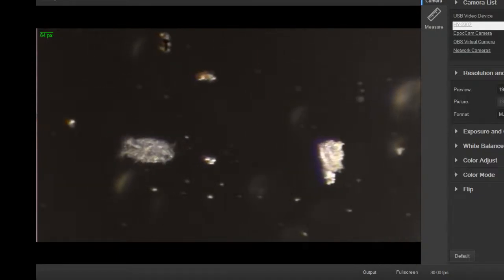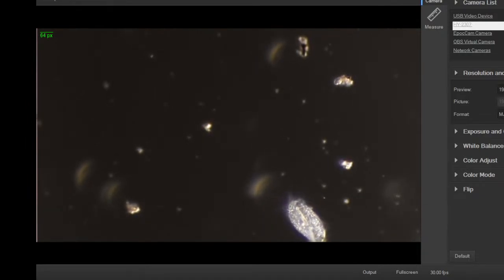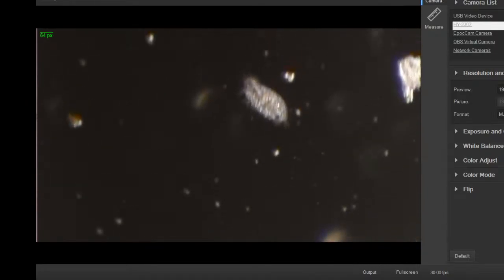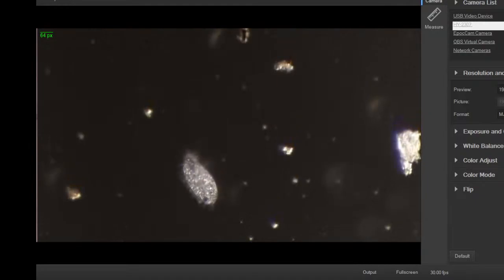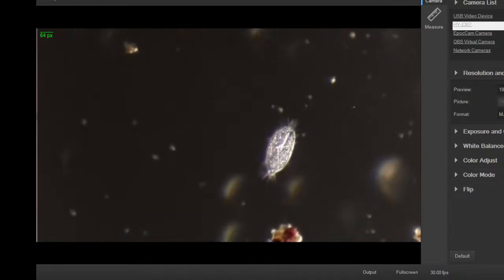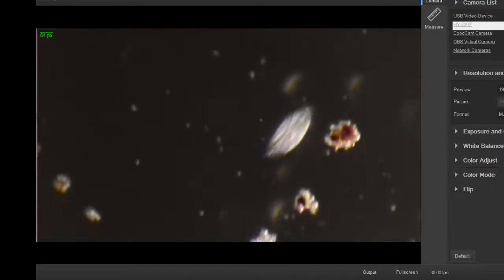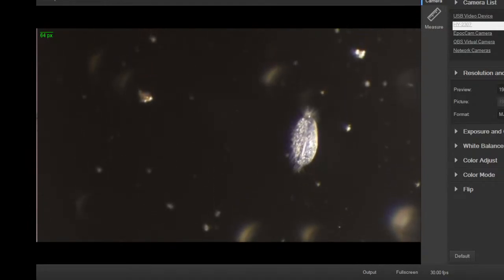Because it's a drop of water, there's enough thickness at this scale that, as you see, occasionally I have to refocus to catch this guy. It's going up and down as well as side to side, in X and Y as well as the Z plane. And those little guys zipping by are sometimes way out of focus because they're way behind it. It's a nice little specimen though. Yeah, see, when it hits that thing, it bounces off and kind of jerks. It's rejecting the large particles.